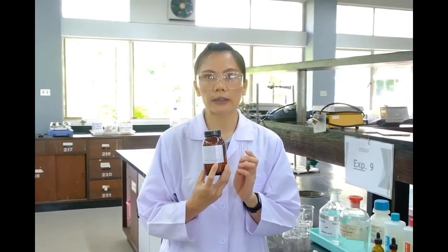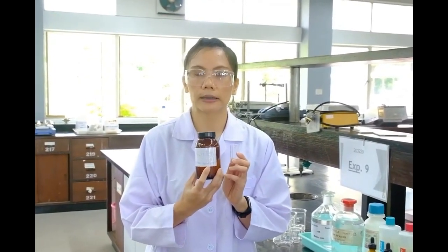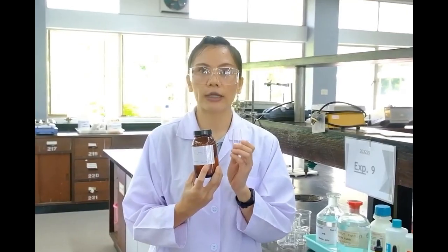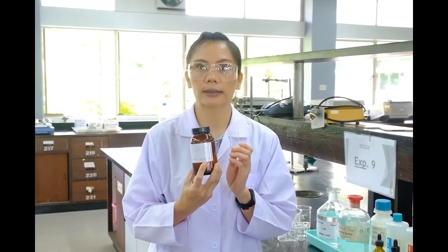Alternatively, students can weigh 0.25 to 0.30 grams of KHP 3 times into a weighing flask, dilute with 75 milliliters of distilled water, and titrate with sodium hydroxide 3 times.